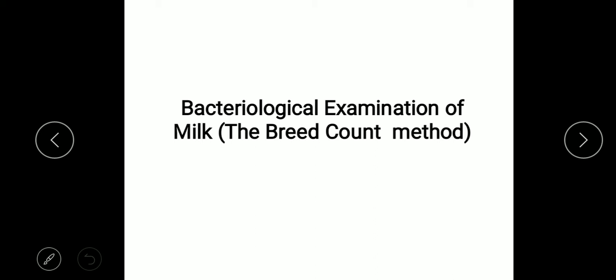Thermophiles, psychrophiles and dead bacteria would fall in this category. The second advantage is that the presence of excessive numbers of leukocytes and pus forming streptococci on a slide will be evidence that the animal that produced the milk has an infection, which we also call mastitis.